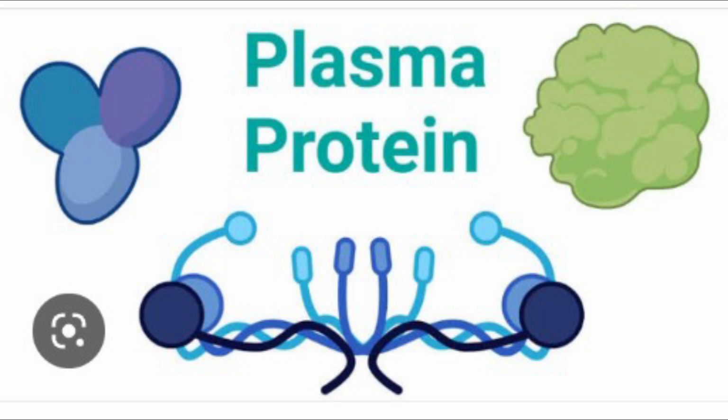Xanthoproteic test. Aromatic amino acids like tyrosine and tryptophan react with nitric acid and give a yellow color. Sample 2 ml plus 1 ml concentrated nitric acid, boil for a minute and cool under running water. Observe for color. Yellow color immediately appears if the sample contains either tyrosine or tryptophan. There are further specific tests for individual aromatic amino acids.